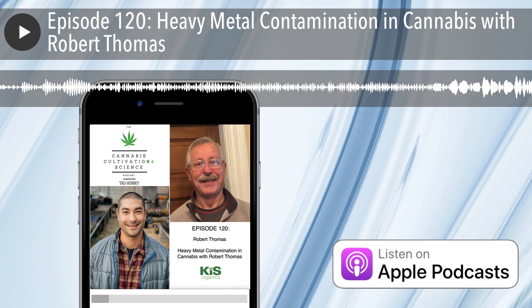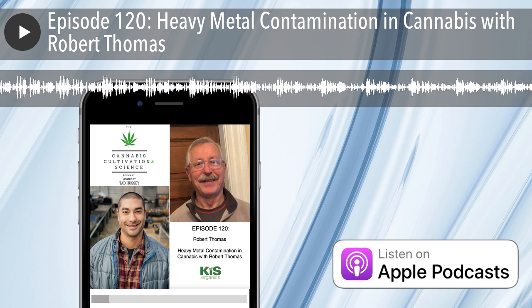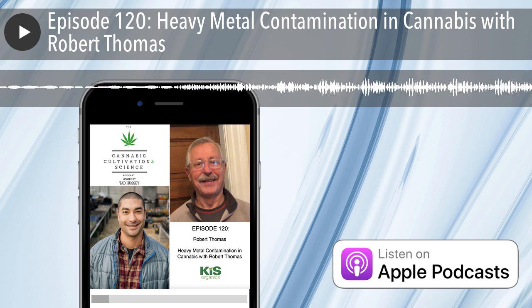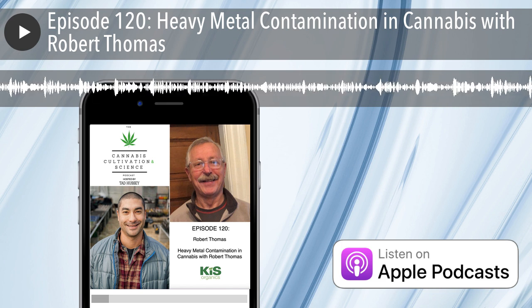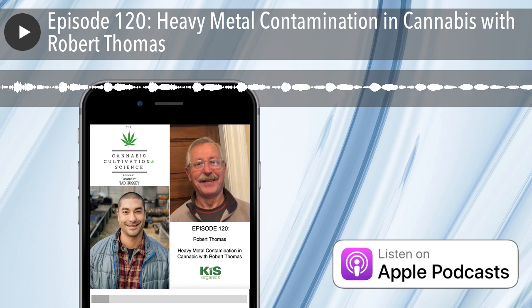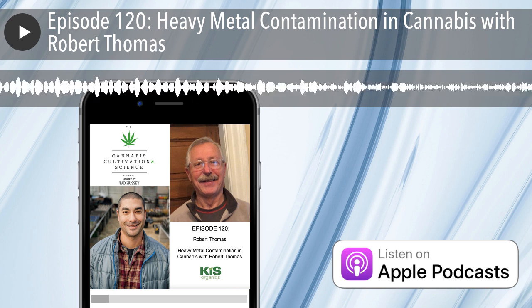I'm not being overcritical here, but I think many of these testing labs have sprung up so quickly that they've ended up in warehouses in places which are not ideally suited to put a lab. So the contamination issues are there. Maybe the expertise of the operator is not there. Sometimes they don't hire the best people. So all of a sudden you find people running these instruments in warehouses. They don't have a lot of experience in using an ultra trace element technique that can get down to parts per quadrillion. But if they're being run in a warehouse, it's almost meaningless.